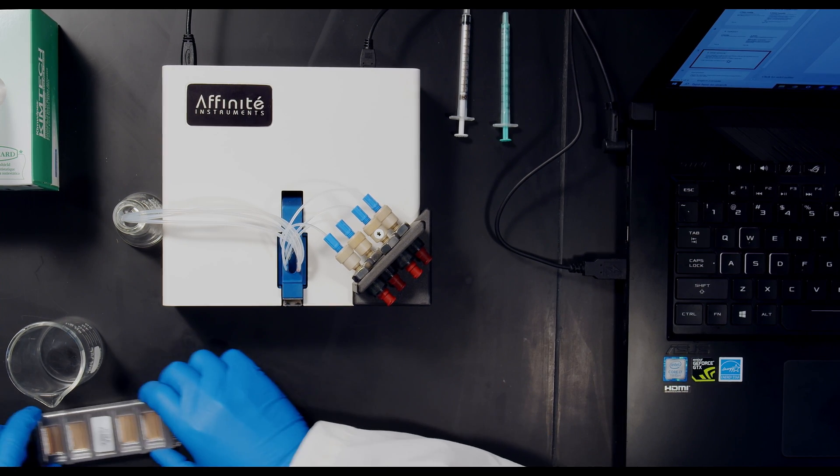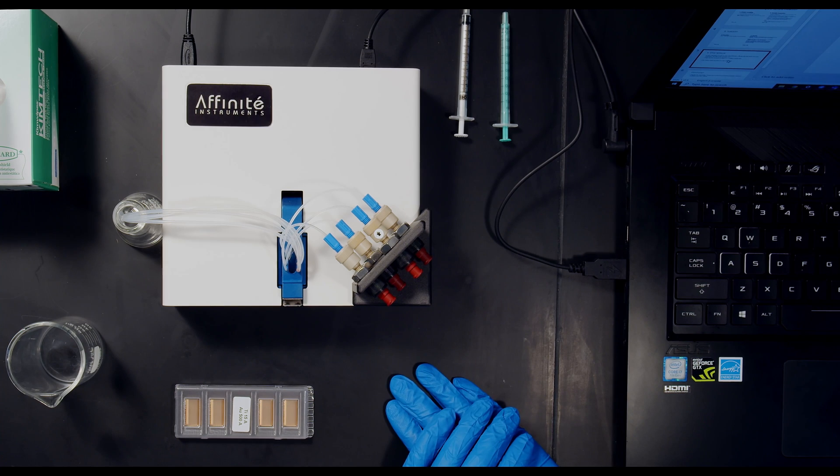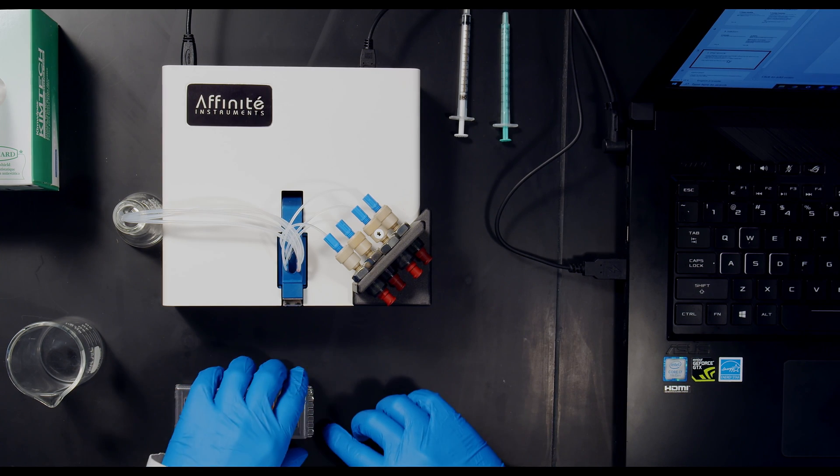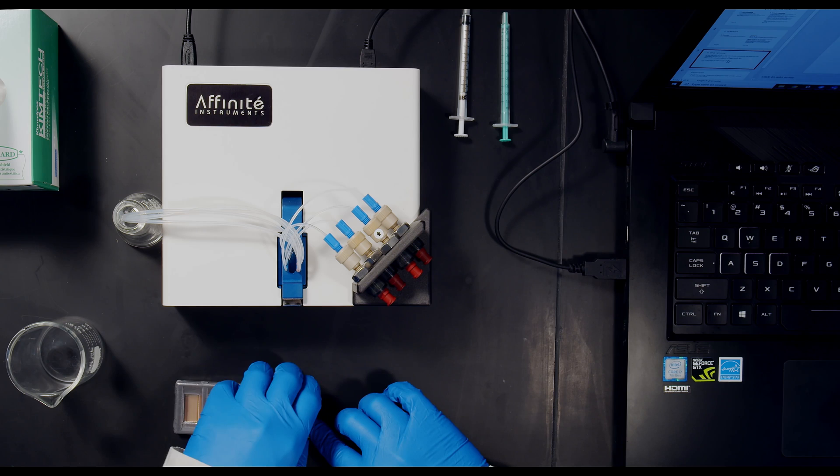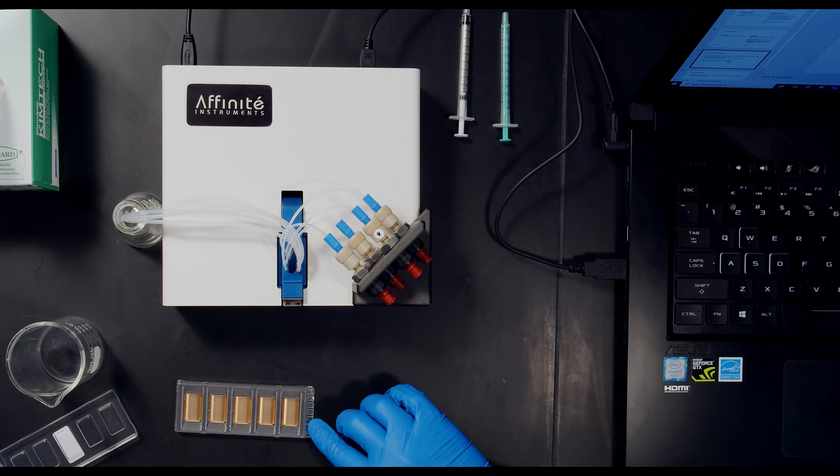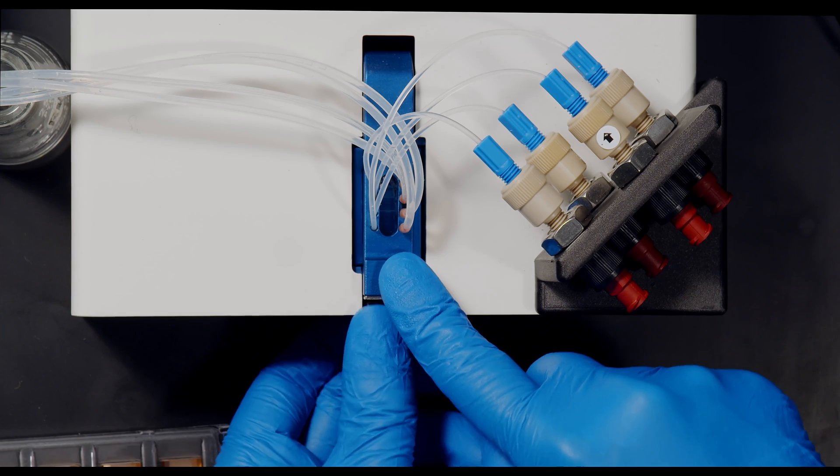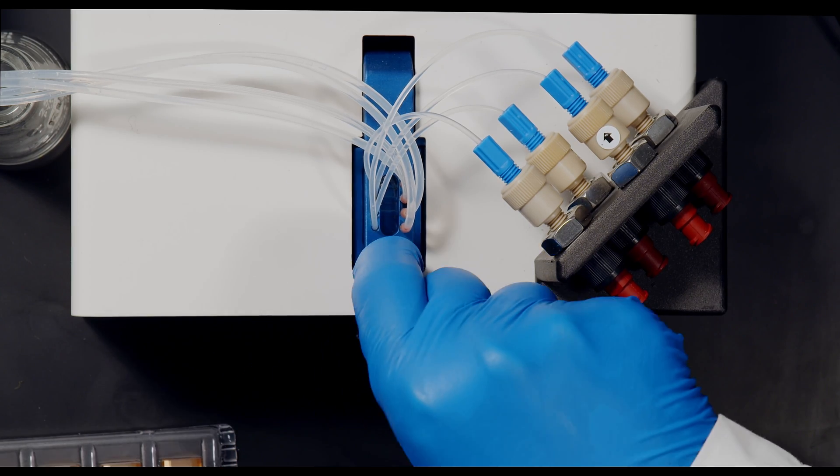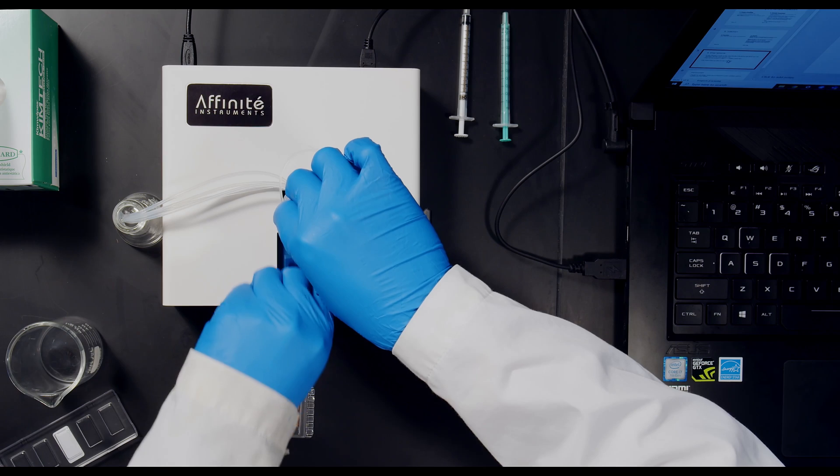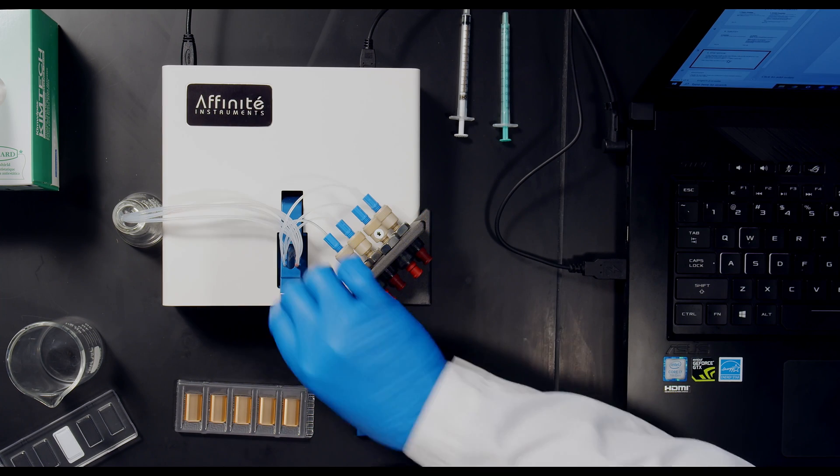Step number one is I'm going to take my package of gold sensor chips, and just by prying open one of the corners, gently lift up the cover of the tray. And then I'm going to remove the chip holder from the instrument by opening the latch, extending the arm upwards, taking out the chip holder, and laying it flat on the bench.